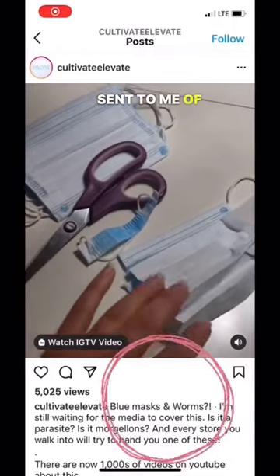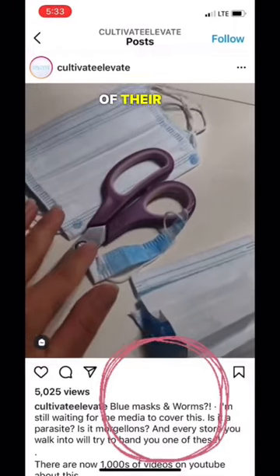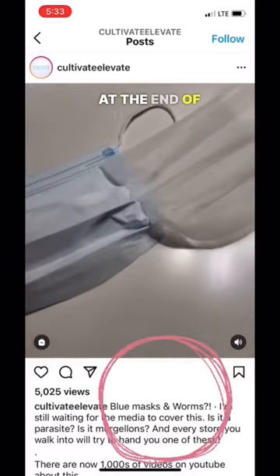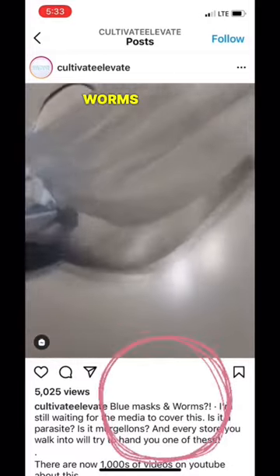I keep getting these videos sent to me of people claiming that there's worms inside of their face masks. I'll show you what these really are under my microscope, and at the end of the video, I'll show you what microscopic worms actually look like.